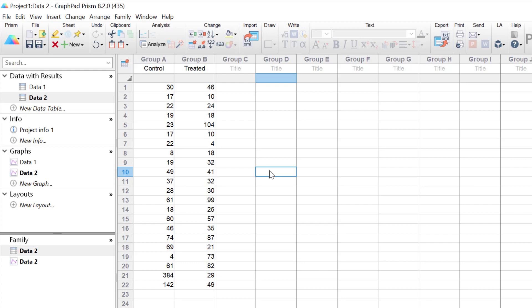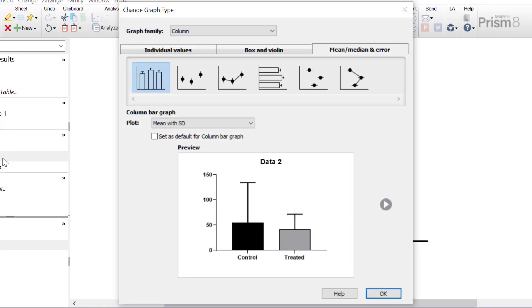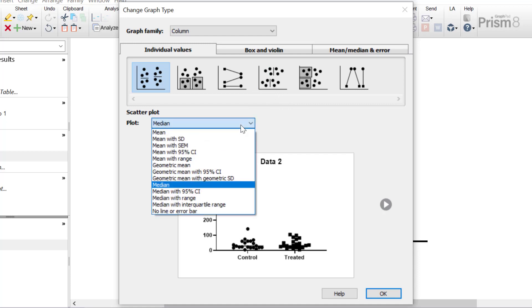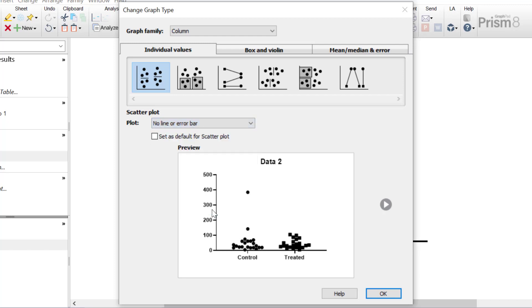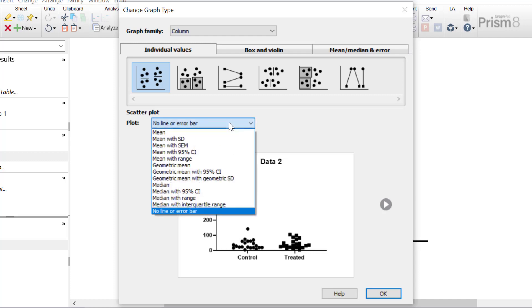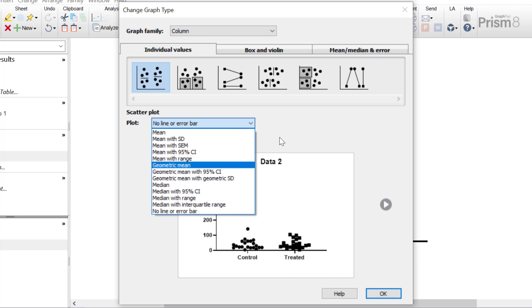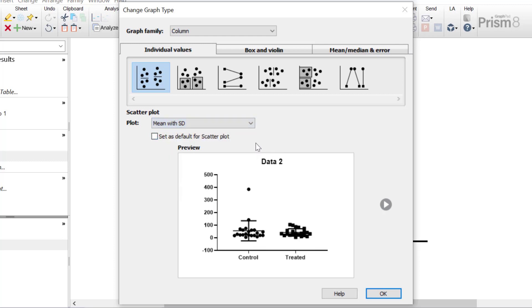To begin creating the column scatterplot, I'll click on the connected graph sheet in the left-hand window to open the graph wizard. With the column graph family selected, click the individual values tab. The first option is scatterplot, and underneath there is a drop-down where you can choose what is plotted — no lines or error bars so only replicate values are plotted, or if you have large amounts of data you may wish to plot additional information such as the mean, or the mean with error bars like standard deviation, standard error of the mean, or 95% confidence intervals, as well as the range. You can do a similar thing for the geometric mean and the median. For this example I'm going to plot the mean with standard deviation as well, then click OK.